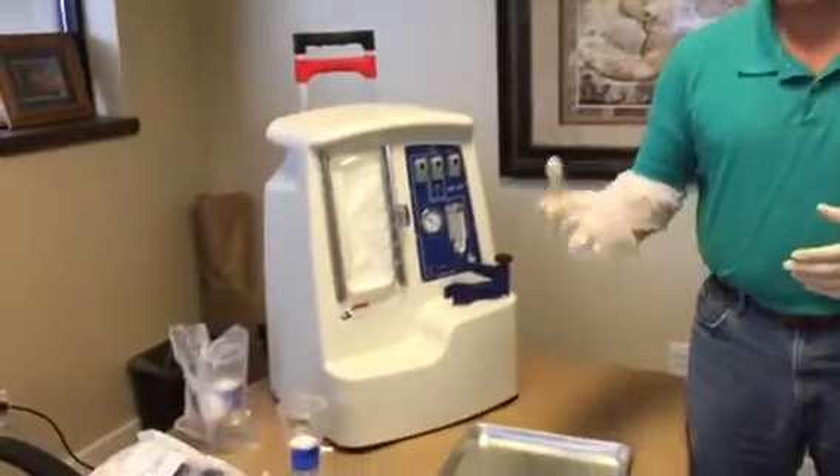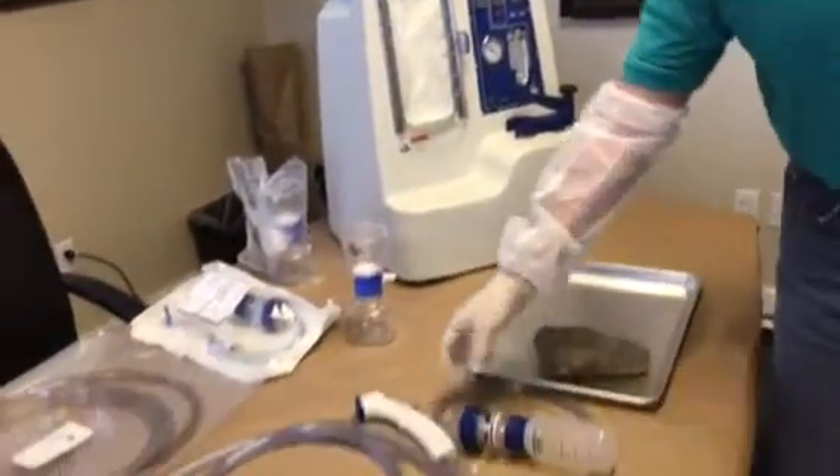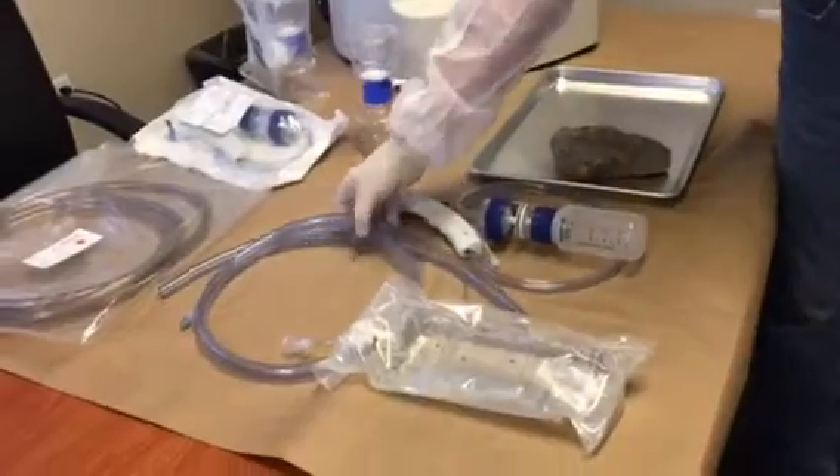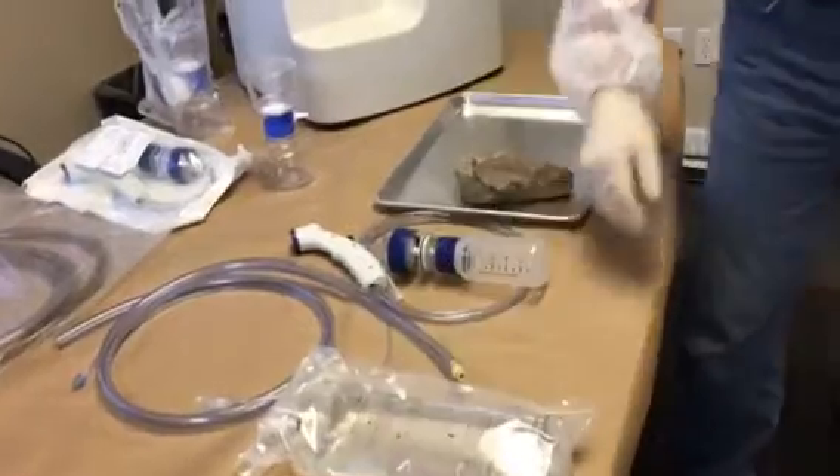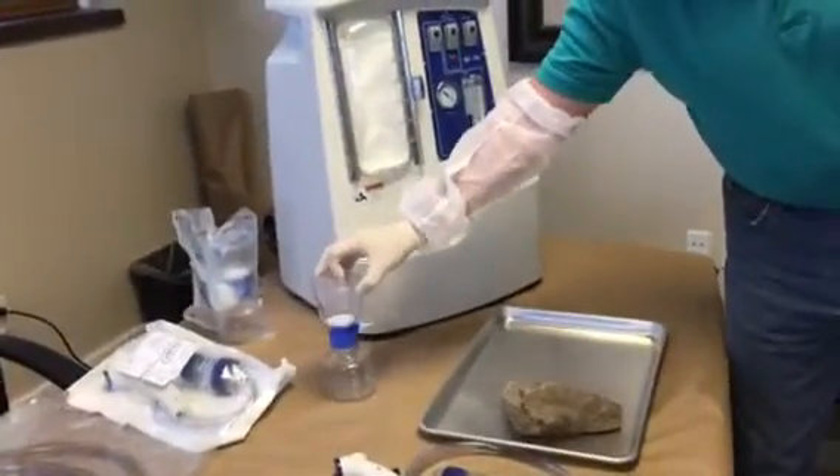I'm going to show really quick — this is what's called a support equipment case, and the four consumables, which consists of the actual MVAC, extension tubing, the solution delivery or the solution bag, and then the concentration filter.